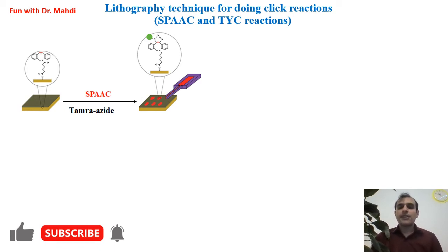In the next step, we use the lithography technique. We injected TAMRA azide. TAMRA azide is a fluorescent ink. It's red. We injected TAMRA azide and we printed it on this surface. This surface contains cycloalkyne. We need to leave it for 1 hour, and after 1 hour, we need to wash it. With water, we wash the surface.